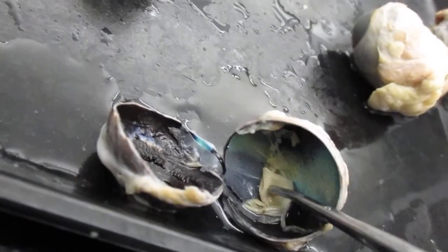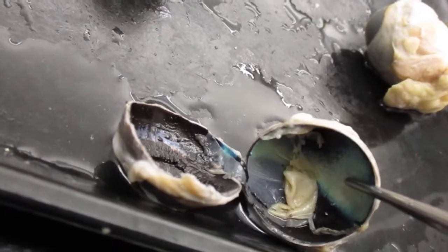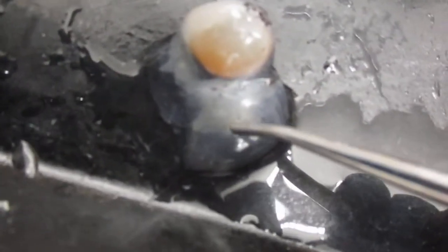Retina, right there, that white stuff. This right here is your tapetum lucidum. This is the lens right here. This is the vitreous humor.